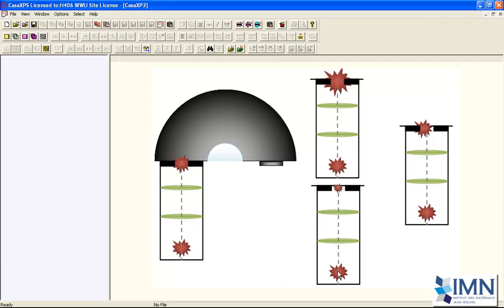Well, one possibility is that the lens at one kinetic energy passes through a reduced image, and this reduced image then forms a hot spot on the detector, and so you get a reduced amount of the detector system collecting the signal, so that might cause one peak to attenuate relative to another.